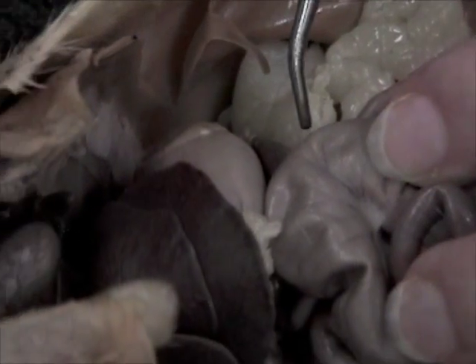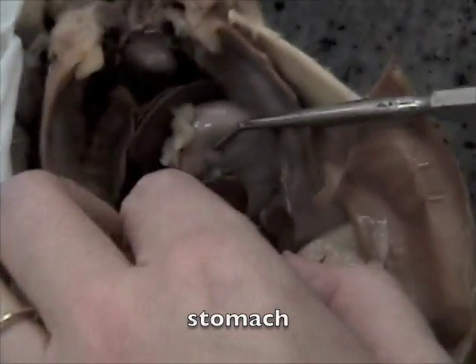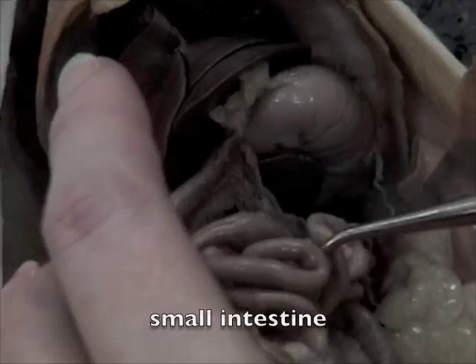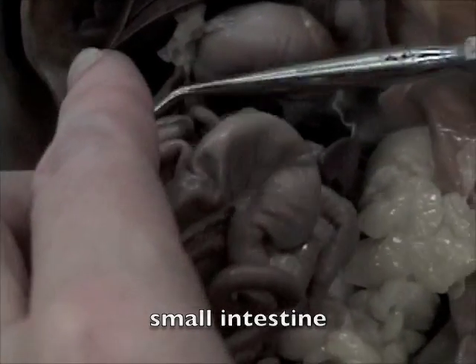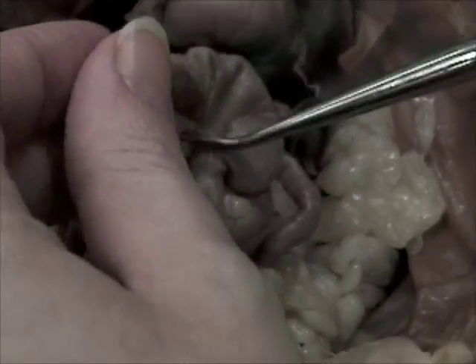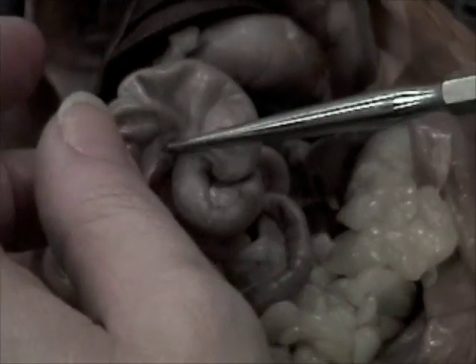It looks similar to the liver? It's got the same color as the liver. Stomach. Coming from the stomach is the small intestine. The small intestine shows a lot of convolutions. Here is the cecum, the appendix.